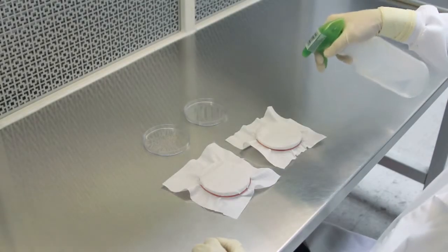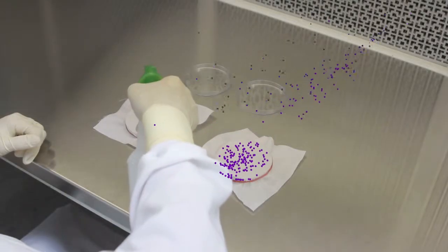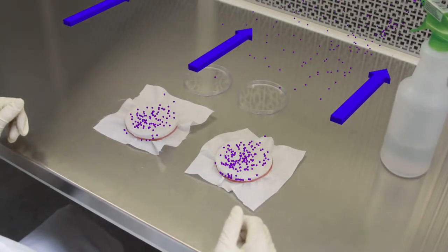If the hood is not operating, air currents from outside of the hood can blow the challenge bacteria away from the fabrics, thereby reducing the bacteria challenge and increasing the BFE.